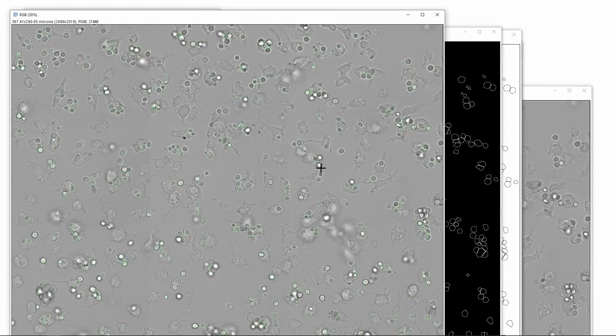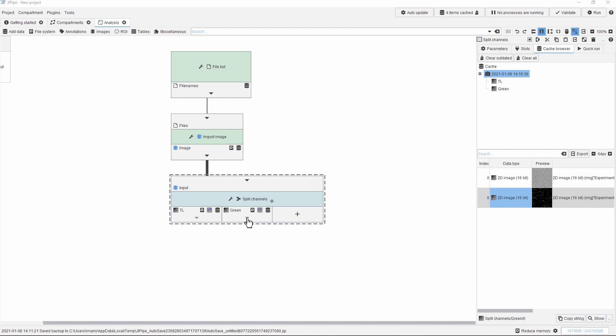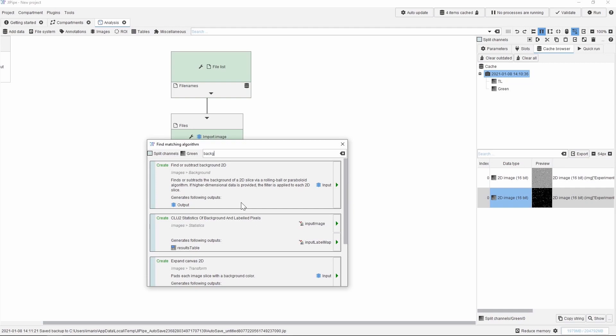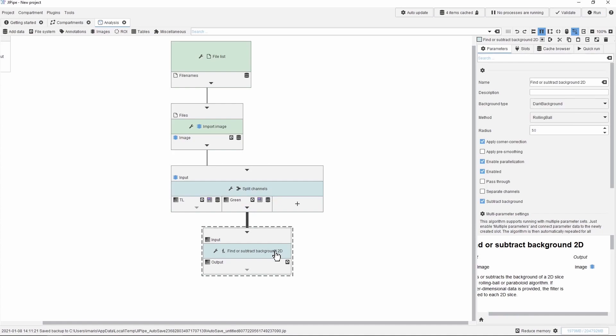After this let us now switch back to Jipipe and carry out the same steps of the processing as we showed for ImageJ. We are processing the green output from the split channels node, and first we want to subtract the background. We did this in ImageJ using the rolling ball method with 22 pixel radius. We select the node, look on the right side, choose the method and then set the radius to 22.